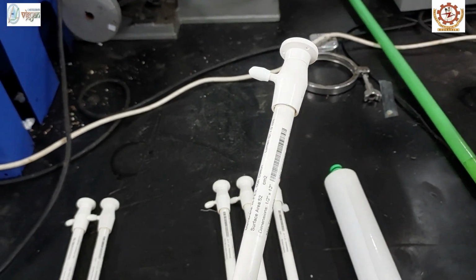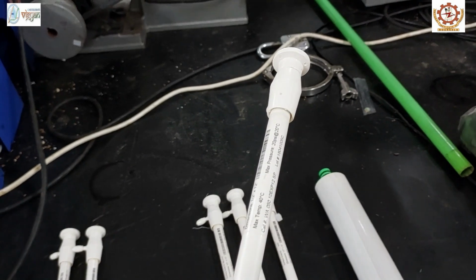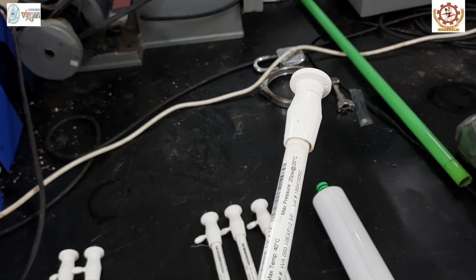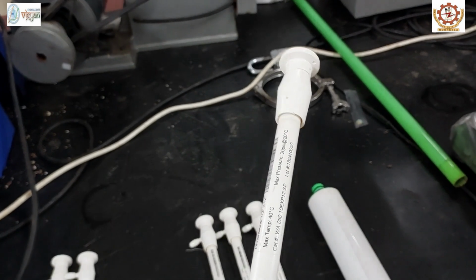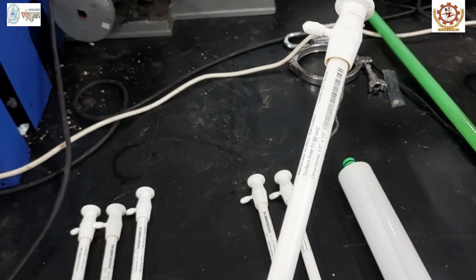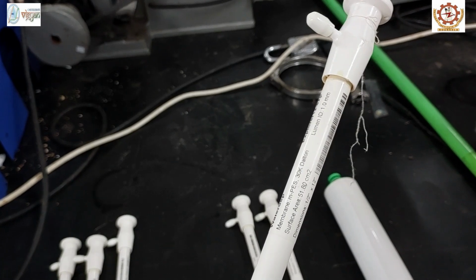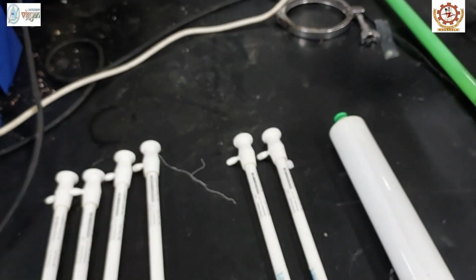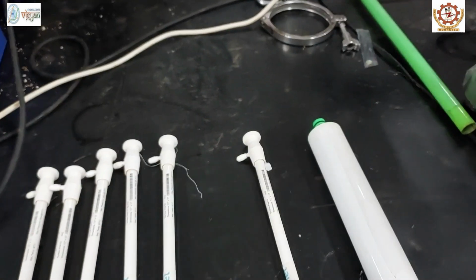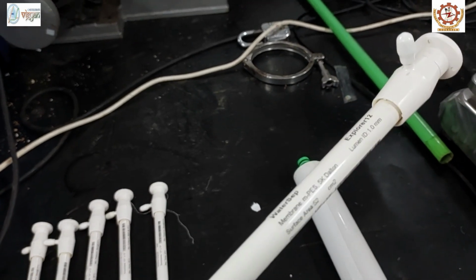Its surface area is 52 centimeter square. It can also withstand a maximum temperature up to 40 degrees Celsius and maximum pressure up to 20 psi. Similarly, this is also an ultrafiltration membrane of 30 kilodalton. This is another membrane of 10 kilodalton. This is another membrane of 5 kilodalton.